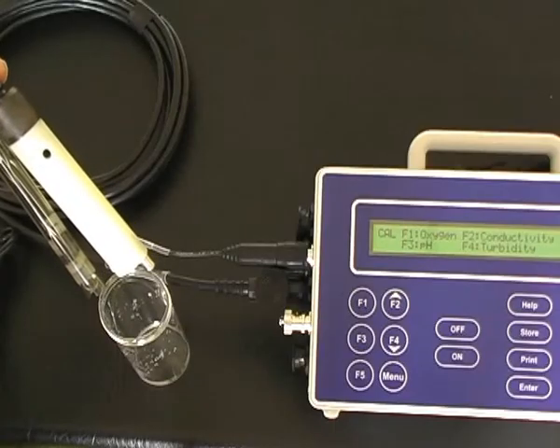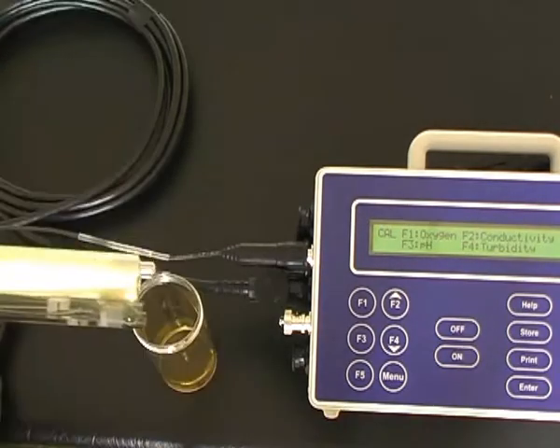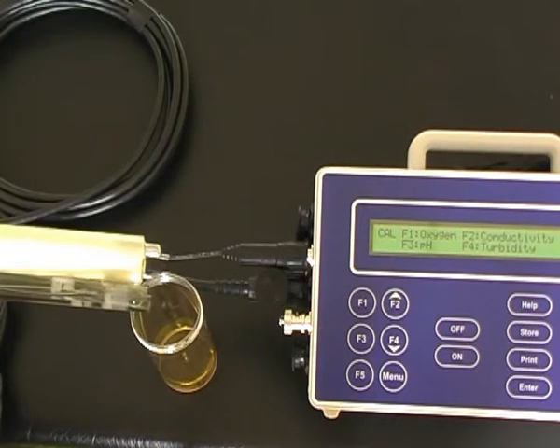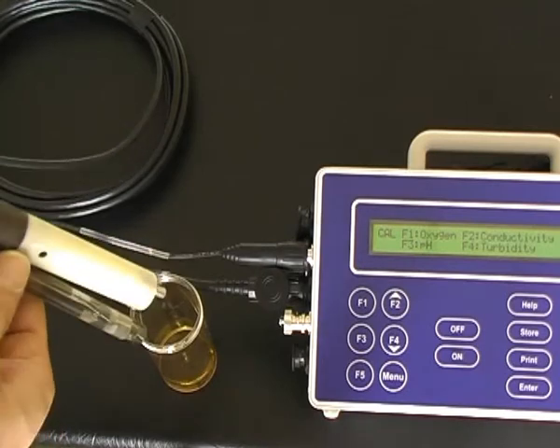Remove the sensors from the pH 4 solution and rinse both sensors with deionized water. Once rinsed, place both sensors, the pH sensor and conductivity sensor, in the second calibration buffer, pH 6.88 for calibration.